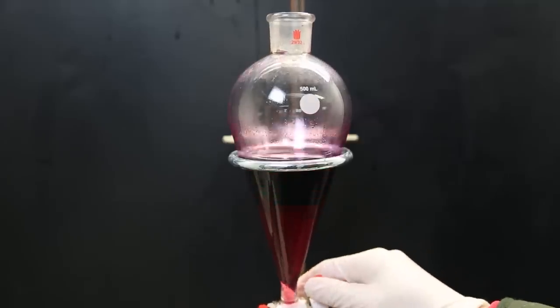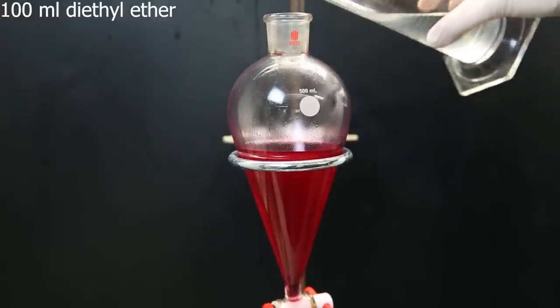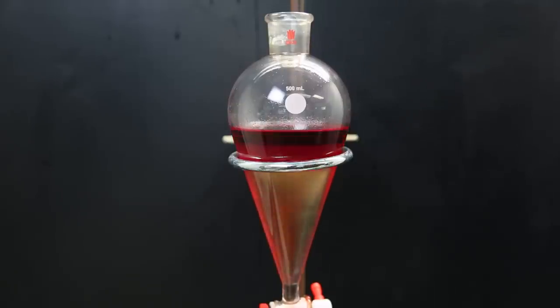I separate the layers, and then add the water layer back into the separatory funnel. I add 100 ml of diethyl ether, to take up the remaining dithiobenzoic acid. We can see pretty much all of the red color has moved into the ether, and I separate the layers again.